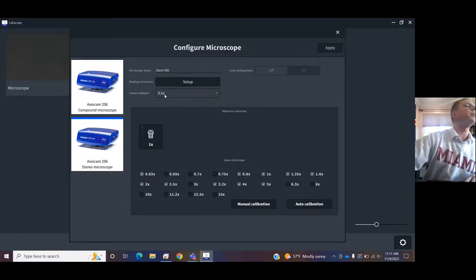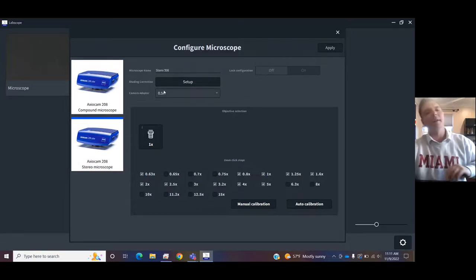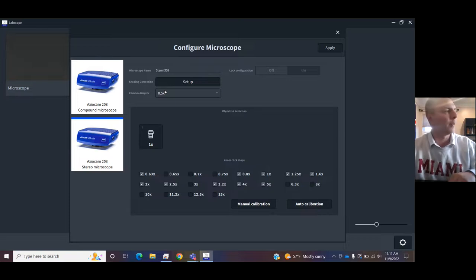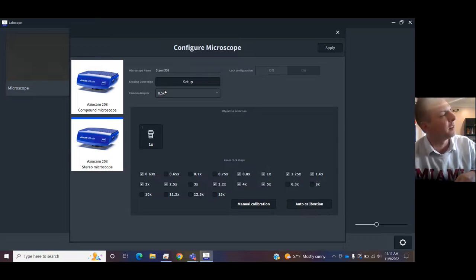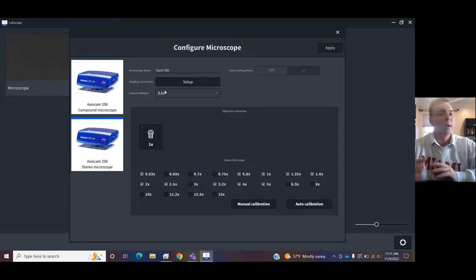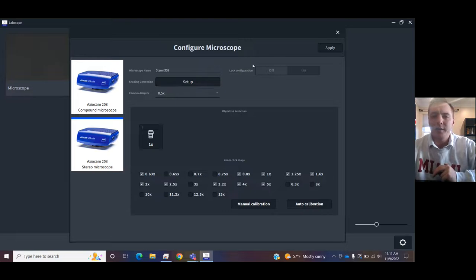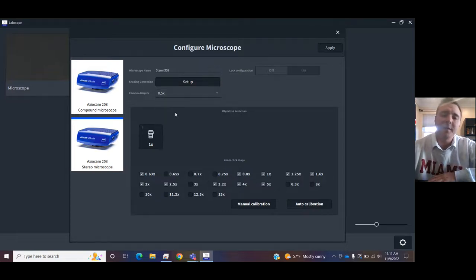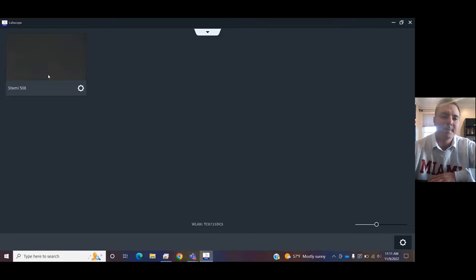Check your C-mount. It should be listed on the C-mount. That is the piece of metal connecting the camera to the microscope. And choose what that value is. I see that mine's 0.5x. I hit apply. That's a one-time thing.